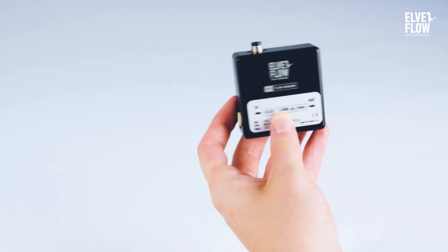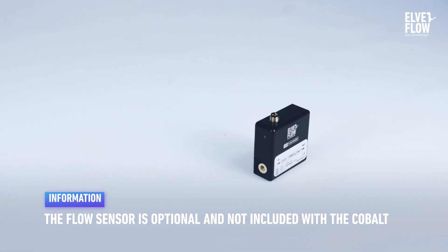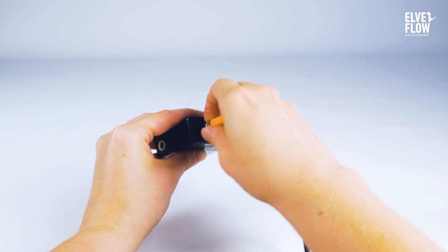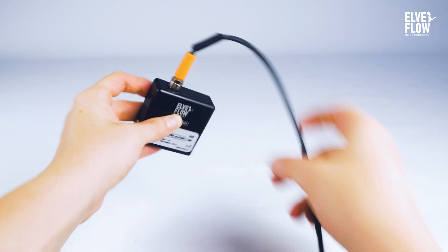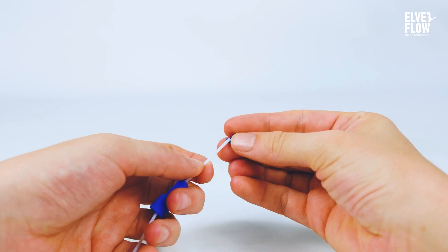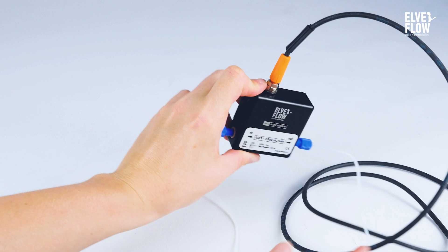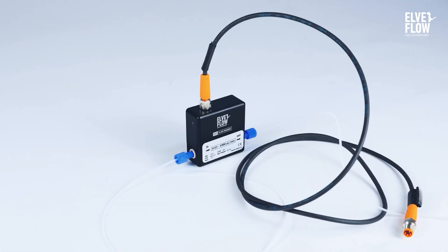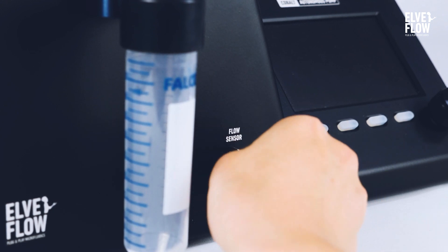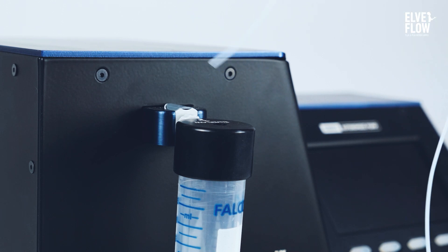To set and control the flow rate, let's add a flow sensor to the setup. Plug the cable into the MFS. Add a piece of tubing to the inlet and the outlet of the sensor. Then plug it into the Cobalt, and connect the tubing.